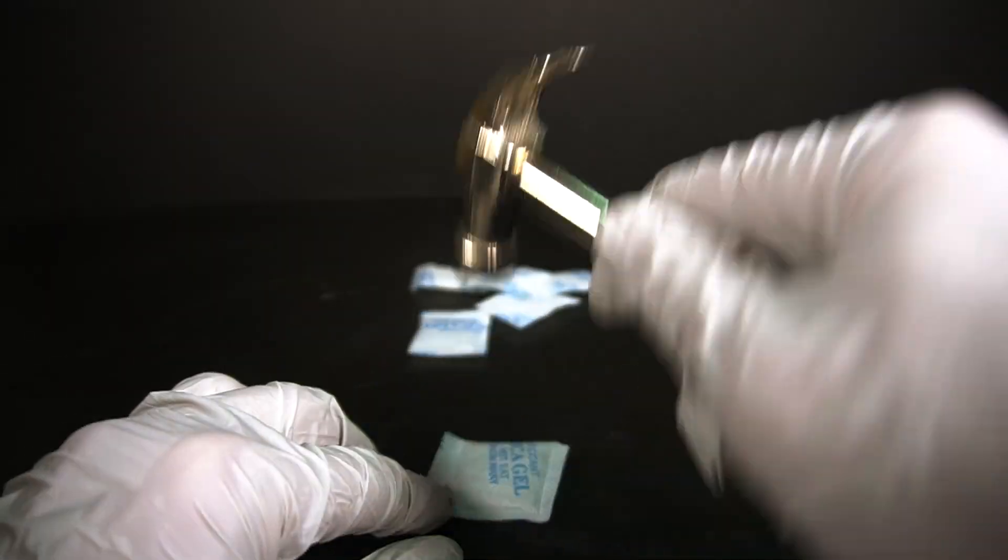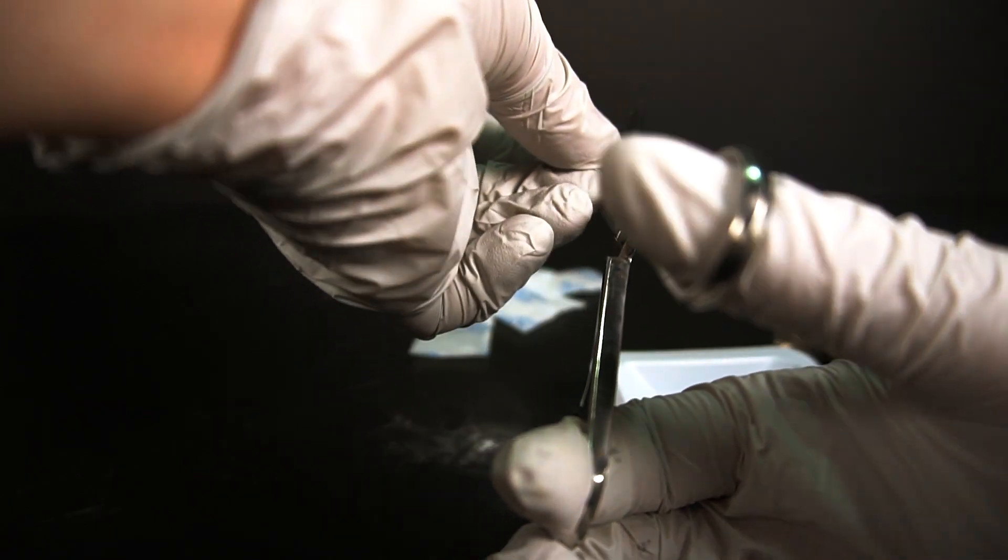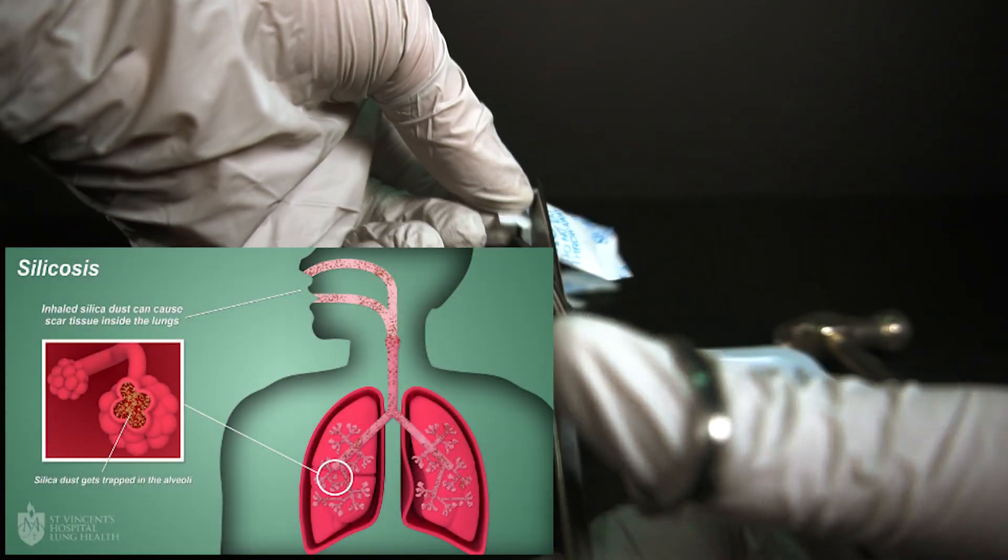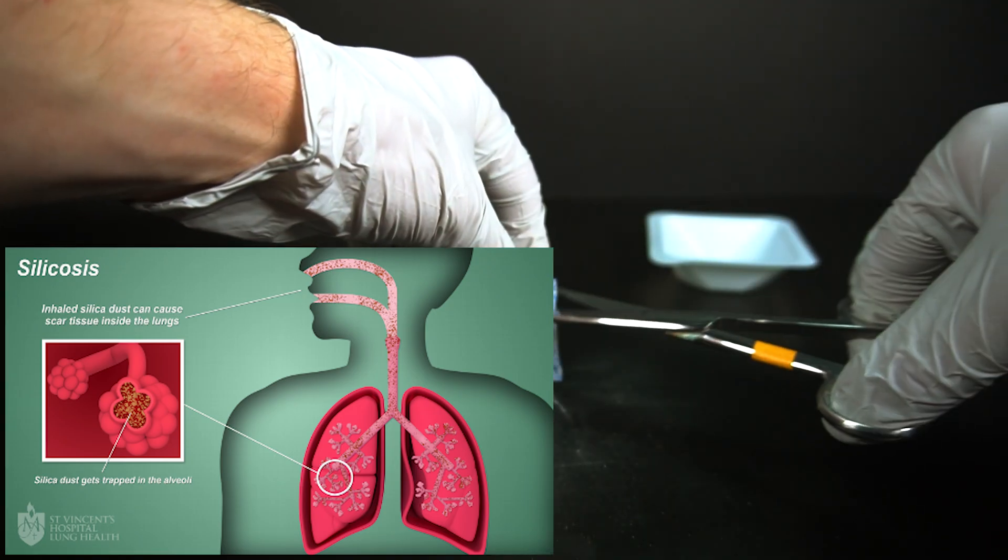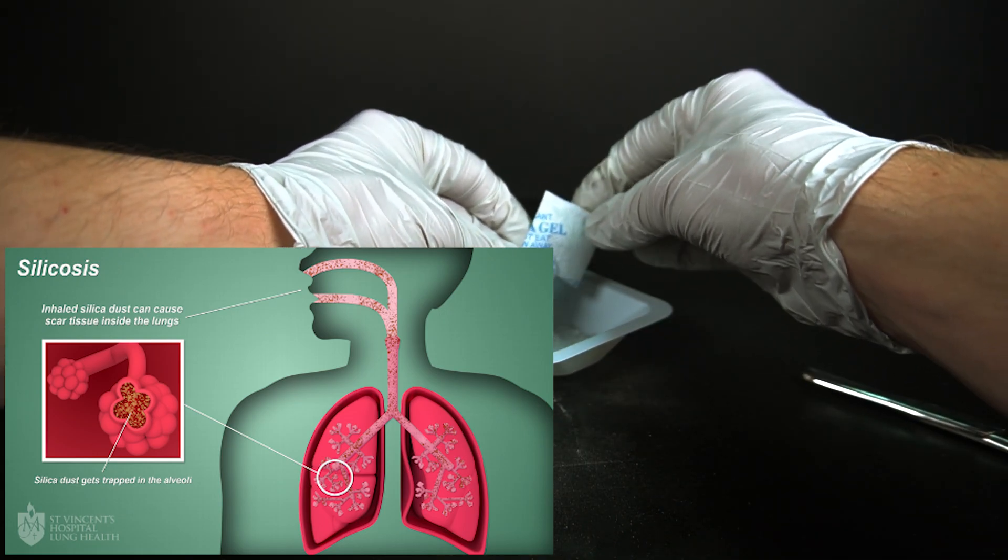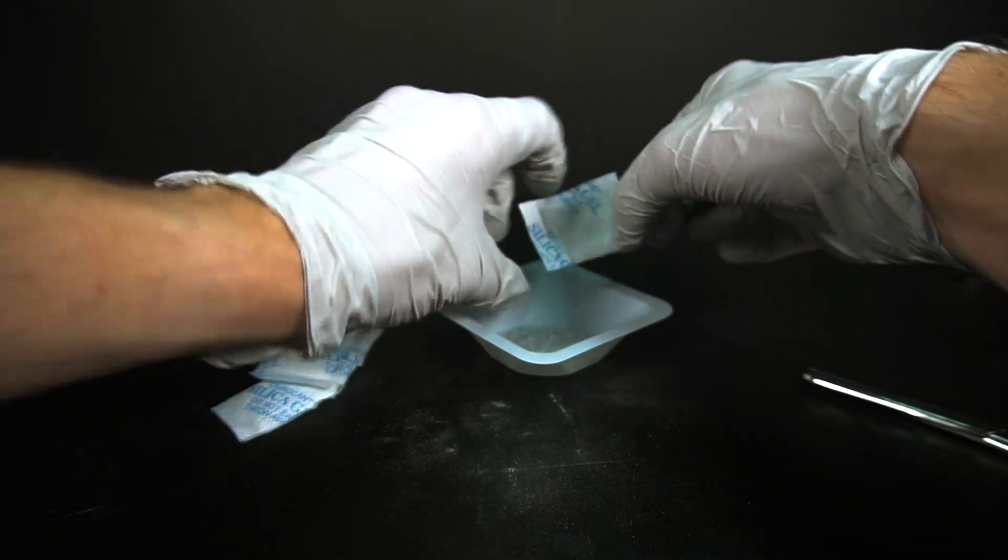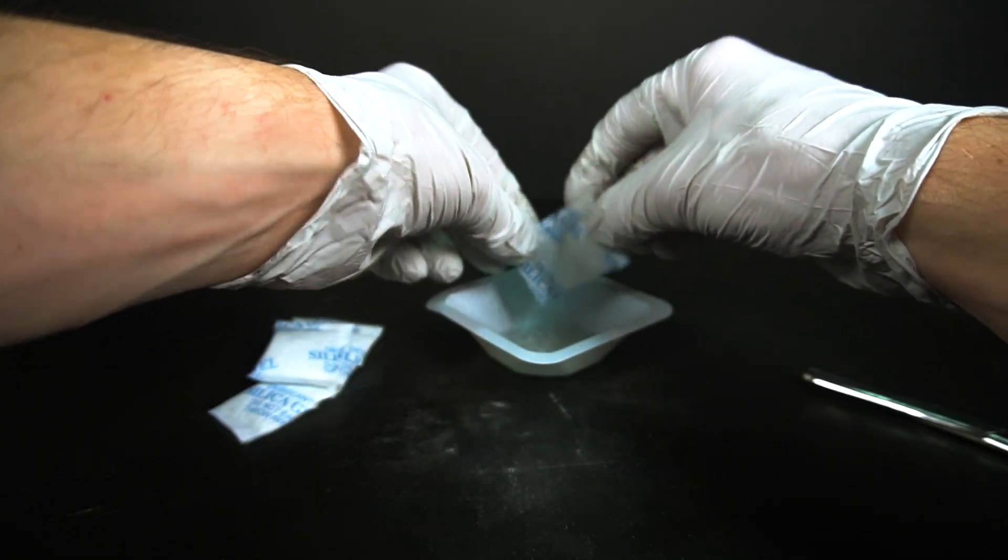As I crush the beads, you will notice a fair amount of silica dust coming off and be really careful not to breathe this in. Breathing in too much of this dust can cause silicosis, so it is always recommended to take personal protection as seriously as possible. I am wearing a full face mask that is made for working with small dust particles. When I am finished crushing up all of the silica beads, I empty them all into a small weighing bowl.